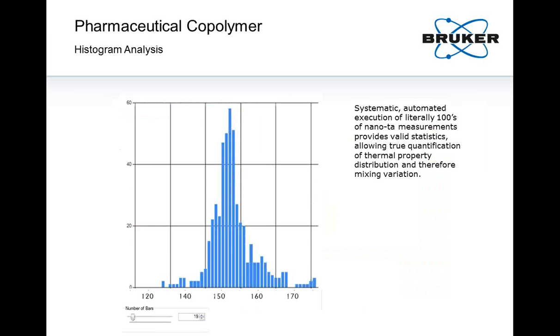If we plot the histogram, the statistics, we can very accurately determine some average transition temperature, but there's also a very clearly measurable width to it, extended shoulders. We can clearly, from this, determine essentially the variation in the copolymer mixing, the property we were after.